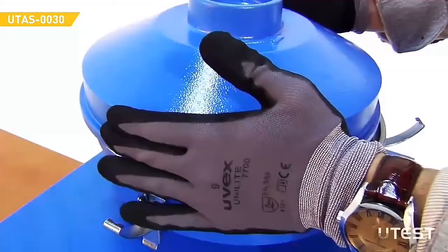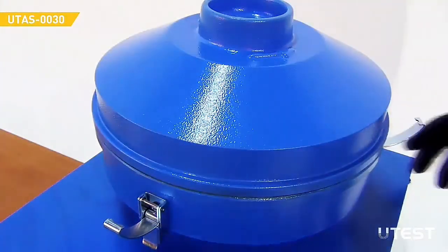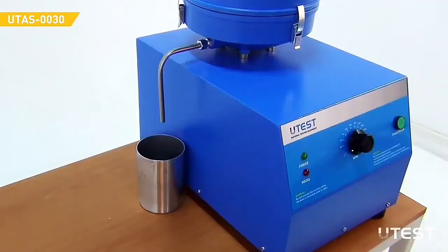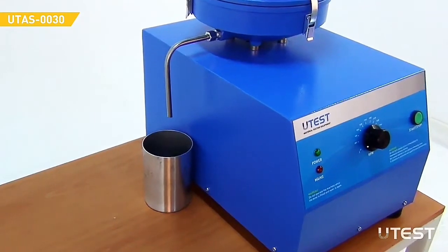Put the cover on top of the outer ball by turning it left and right a few times, and lock it using the three fasteners. Clamp the assembly using the knurled nut. Place a suitable container below the drainage pipe to collect the solvent bitumen solution.